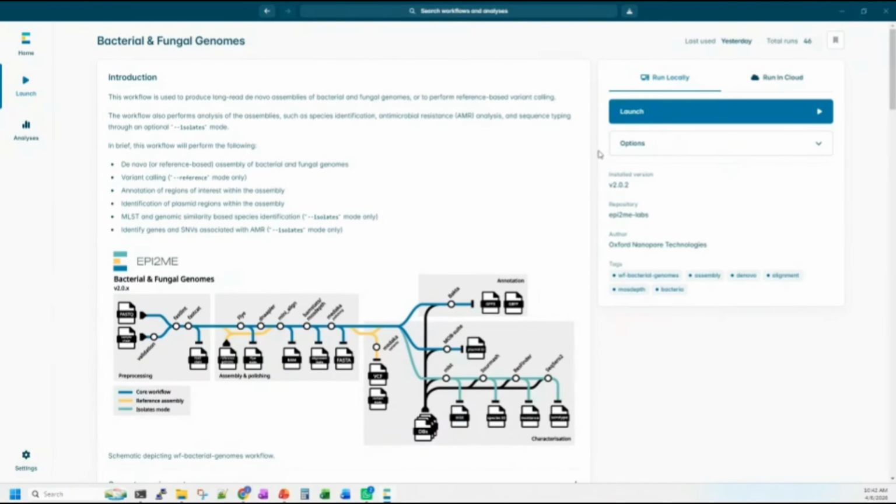So this one, I think they have recently updated to version 2. So for users who have version 1 in the Epi2Me, I think some users have complained that the direct updates might not be so smooth over here. So in case you encounter any problems to update the pipelines to version 2, you can delete the old workflows here, and then install the new workflow once the older one is already deleted. So that can help to fix some of the errors over here if let's say the direct updates is not available.